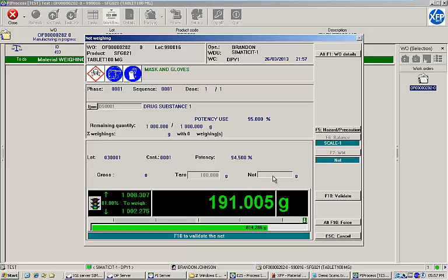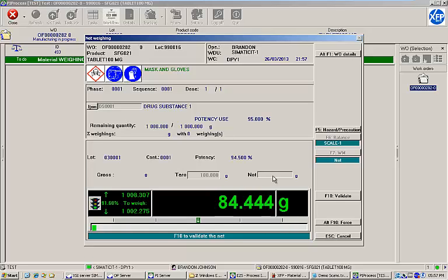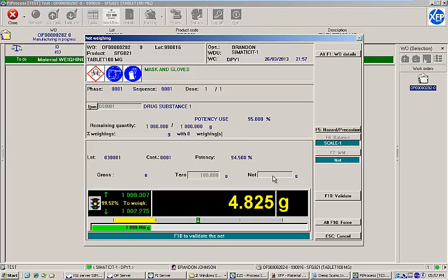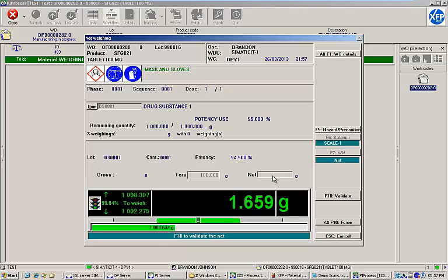As I add weight to the scale, the quantity left to weigh is tracked and displayed automatically. As I approach my range, the bar graph at the bottom of the screen turns yellow to alert me that I have almost fulfilled the requirement. Once the required range is reached, the graph returns to green.